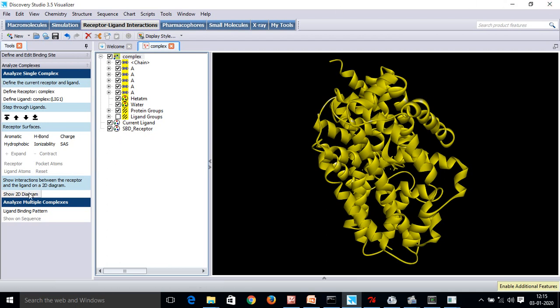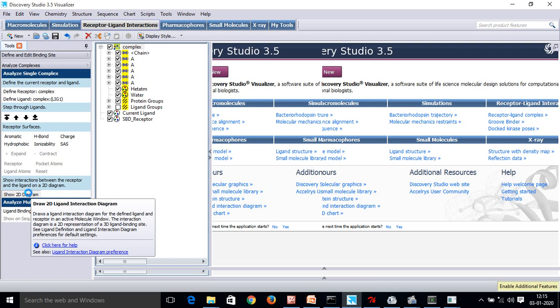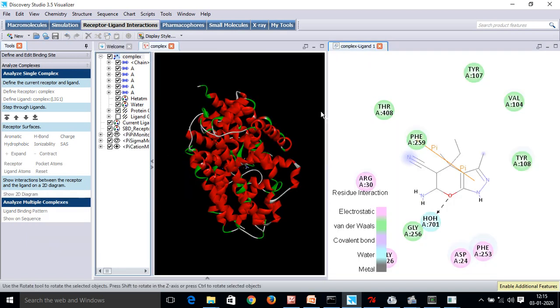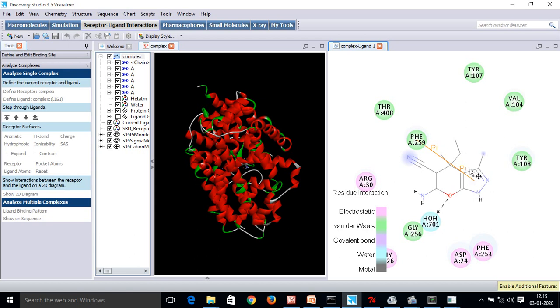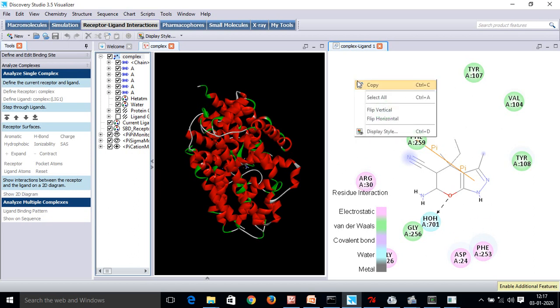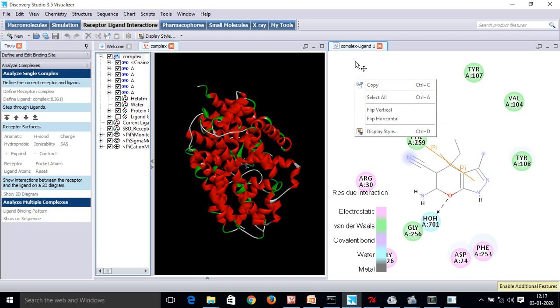Now I will go on show 2D diagram and click. So, these are the interactions that are available with the receptor as well as my ligand. And these are the amino acids and the... Now we can see that the binding interactions are available. We can select on copy and save it in any word file, in any paint and use it for thesis or any dissertation purpose.